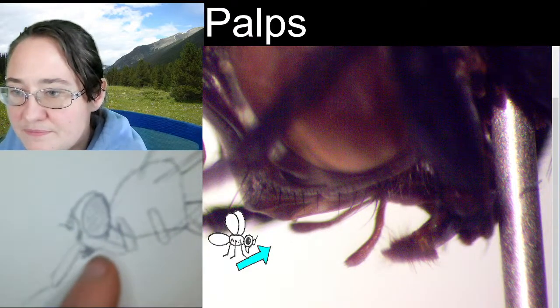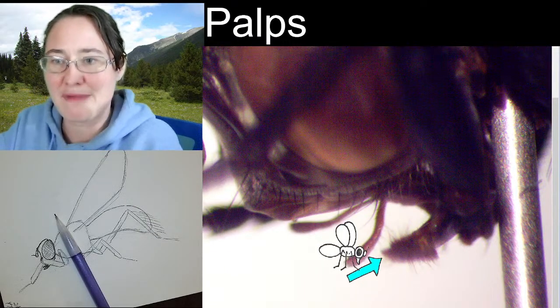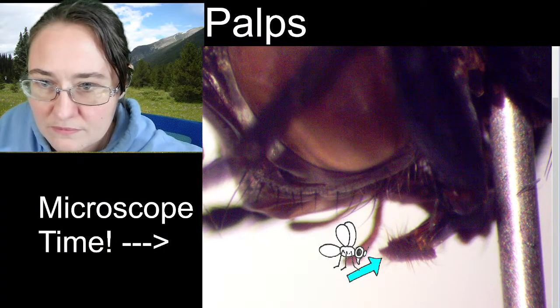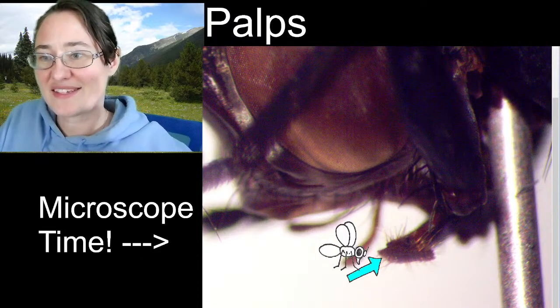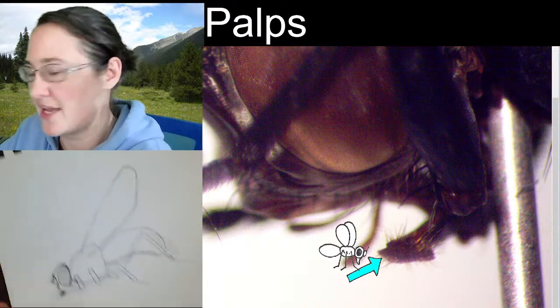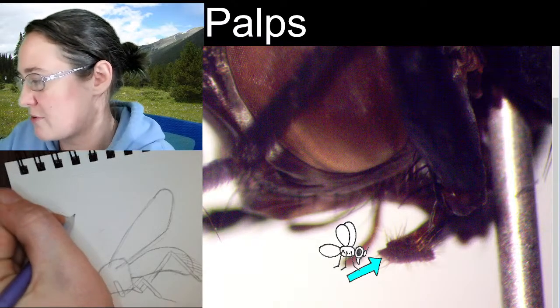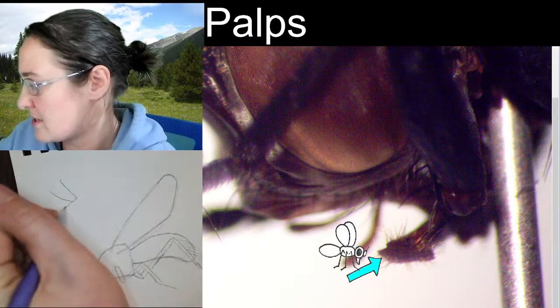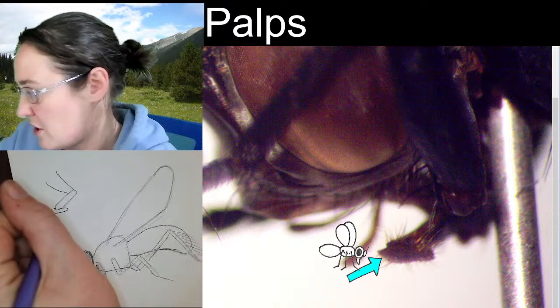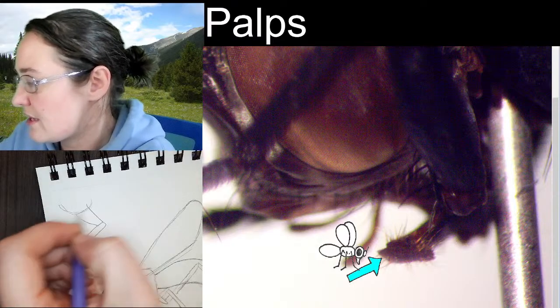Now, also, this right here, this is the mouth part. Flies have a sponging mouth part, and their mouth part has almost a hinge in it. So if I was going to draw almost a cartoon version of this mouth part, I would take a segment, I would bring it back kind of like this, and then I would bring a segment forward more like this, and then I would give it this flat piece here with little itty bitty hairs. Alright, and this whole thing connects to the head.